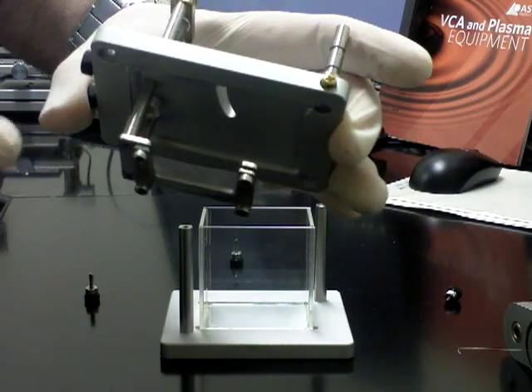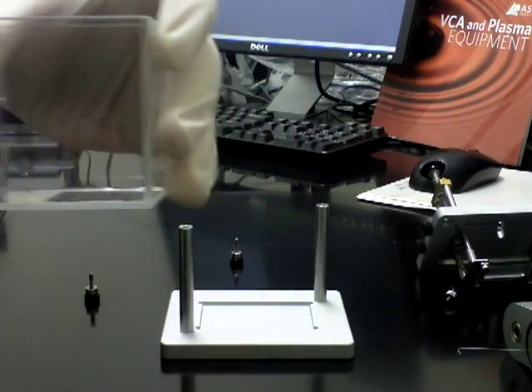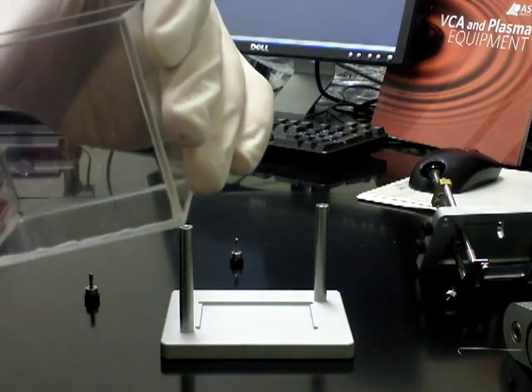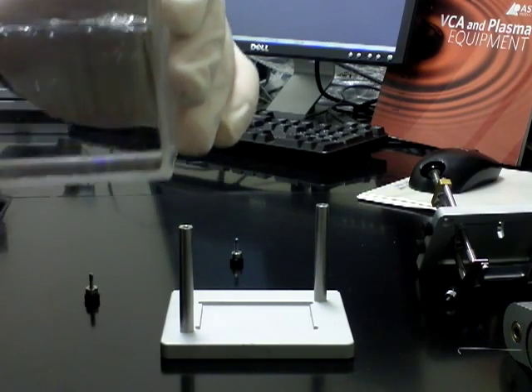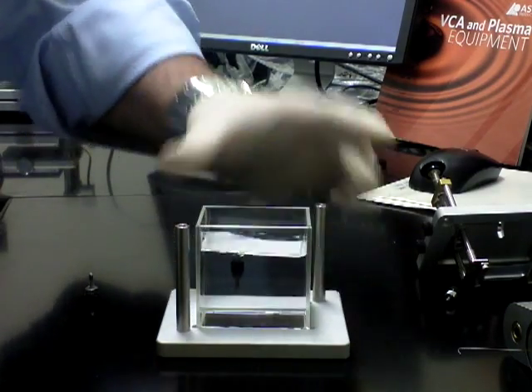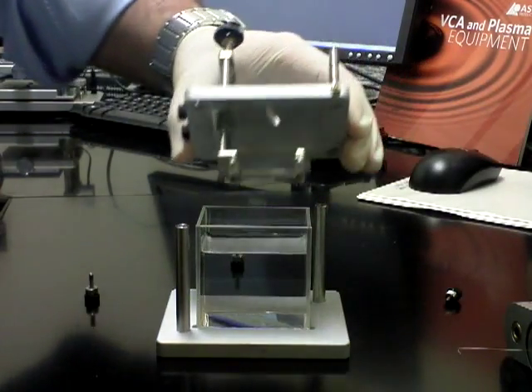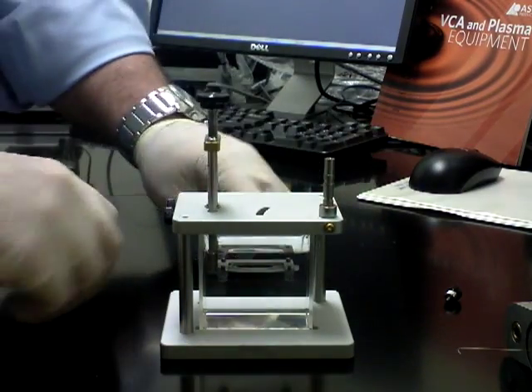This is where you would place your substrate or your film that's going to measure captive bubble. You would take the glass chamber, fill it with water, replace the glass chamber, and put your substrate or film back in with the top, and then screw it into place.